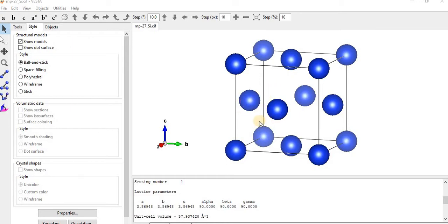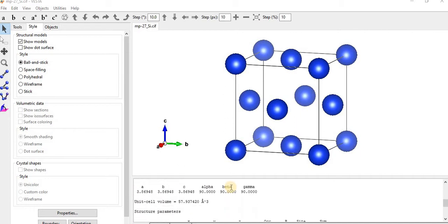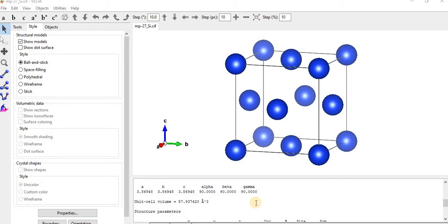Here the lattice type is P and space group name is P1 with space group number 1. As the silicon structure is cubic, a equals b equals c equals 3.86, and the angles alpha, beta, and gamma equal 90 degrees.